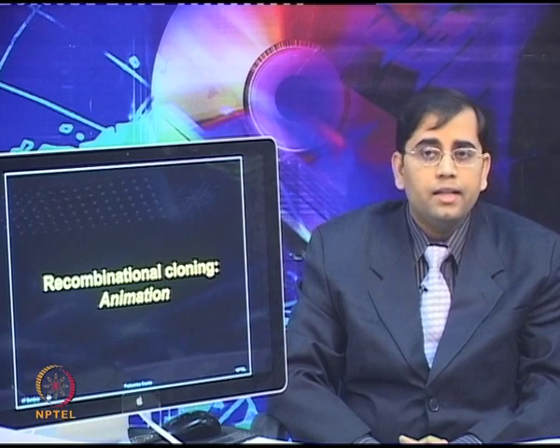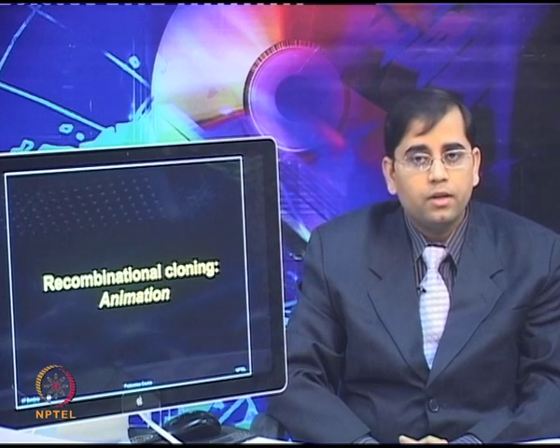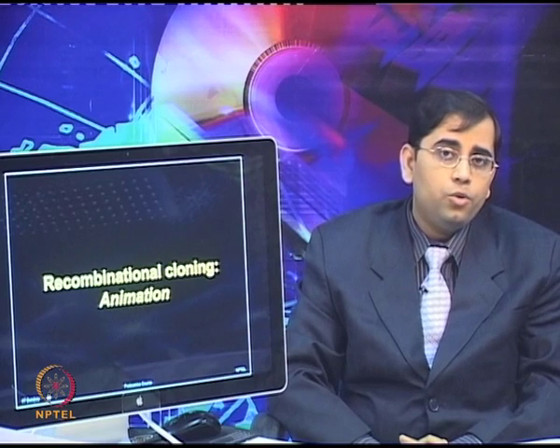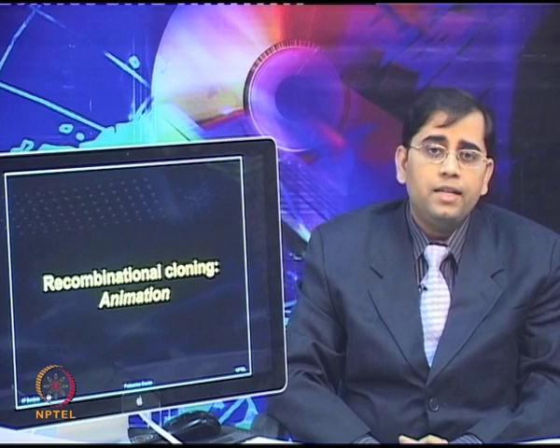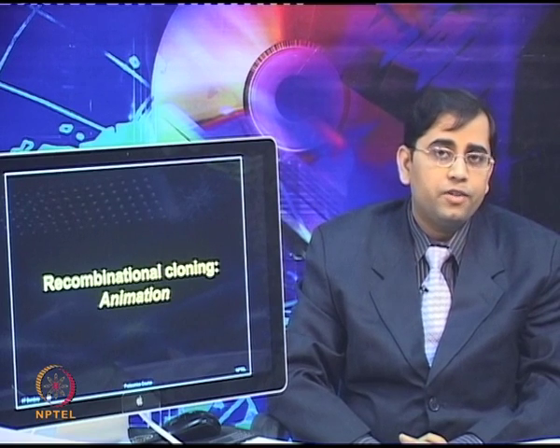So, the Gateway recombinational cloning strategy allows DNA fragments flanked by the homologous recombination sites to move from one vector to another in a single step procedure, in frame and without introducing any mutations. These reactions are very straightforward.